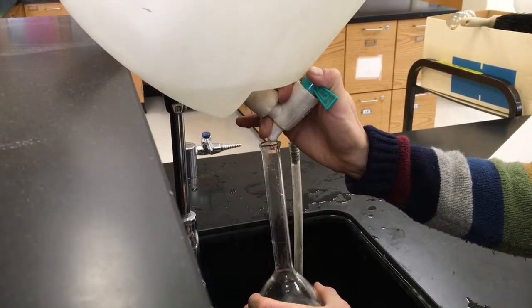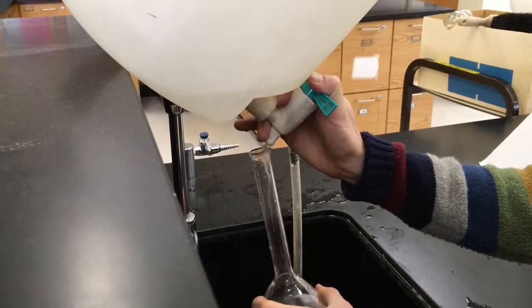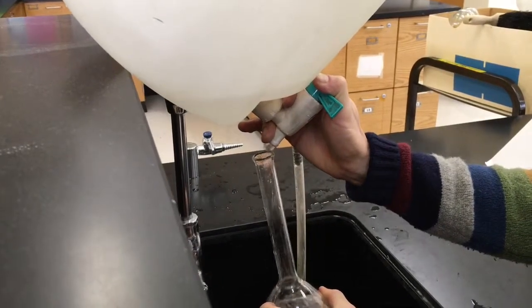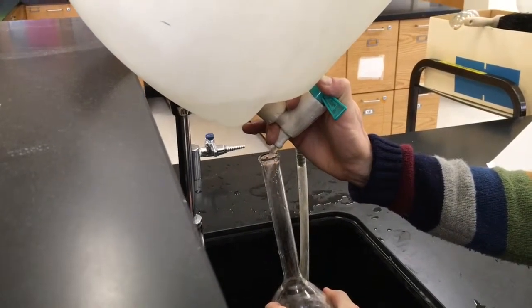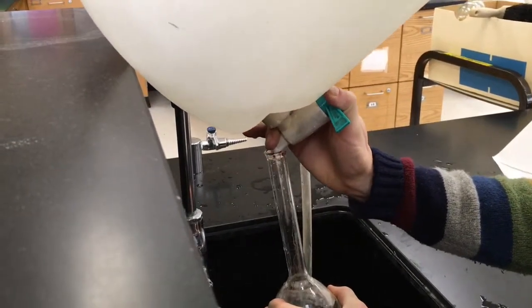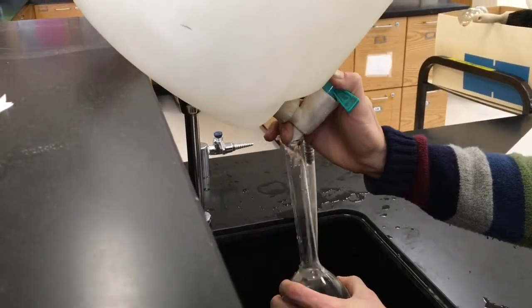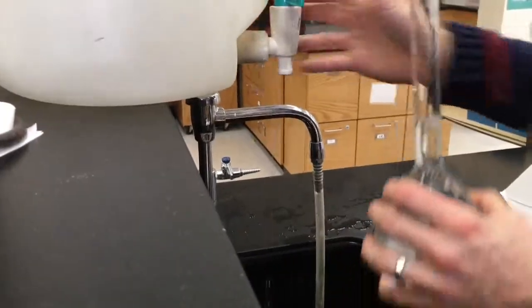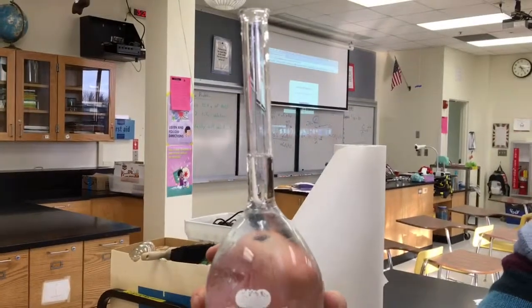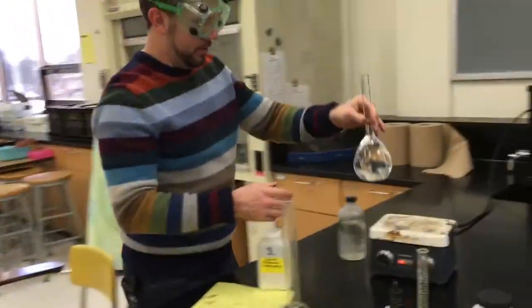And then if I get close, I'll do one of two things. I might just go to the water bottle, which also has distilled water in it. It's gonna be close. Alright, it's starting to get close. Ooh, nice. Don't want to overshoot it. Wow. I was lucky. I mean, that is good. Yeah, a little luck helps.